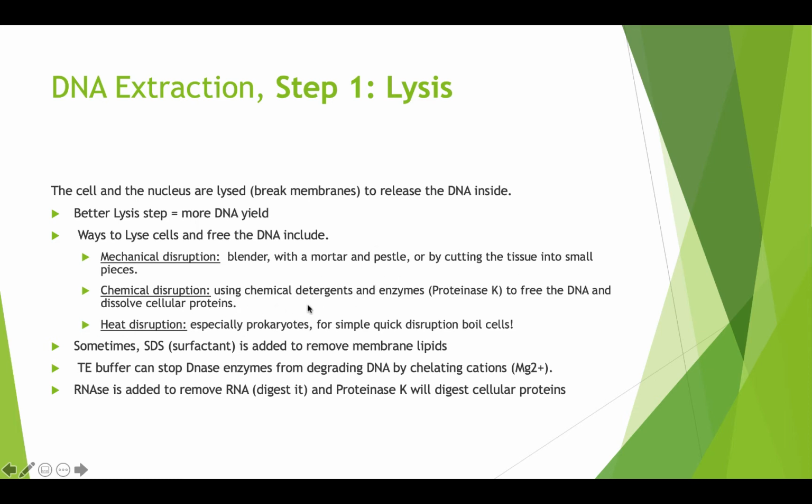Chemical disruption: you can use chemical detergents, like the detergent you use for cleaning. Basically you can use, for example, Triton X to lyse cells. It might be too harsh. Sometimes we use enzymes, proteinase K, SDS, whatever, to break apart these membranes and remove them and free the DNA.